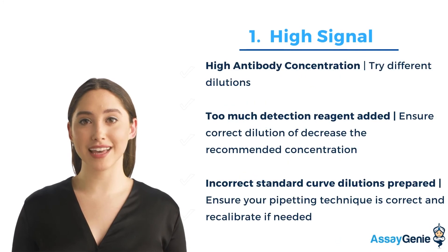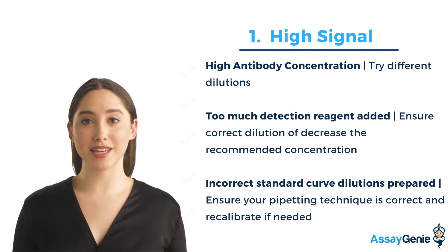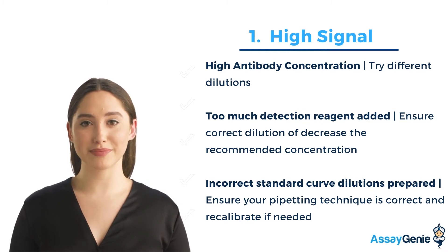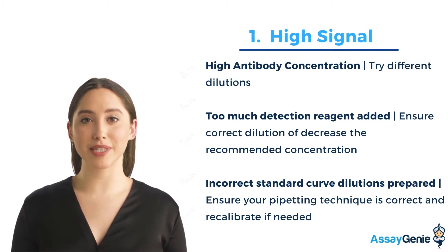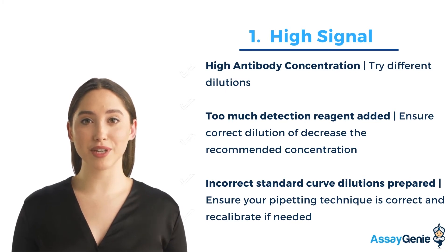High signal may occur for a number of reasons. If you have a high signal, this can result in false positives and incorrect data. High signal may be caused by high antibody concentrations, too much detection reagent, and incorrect standard curve dilutions.